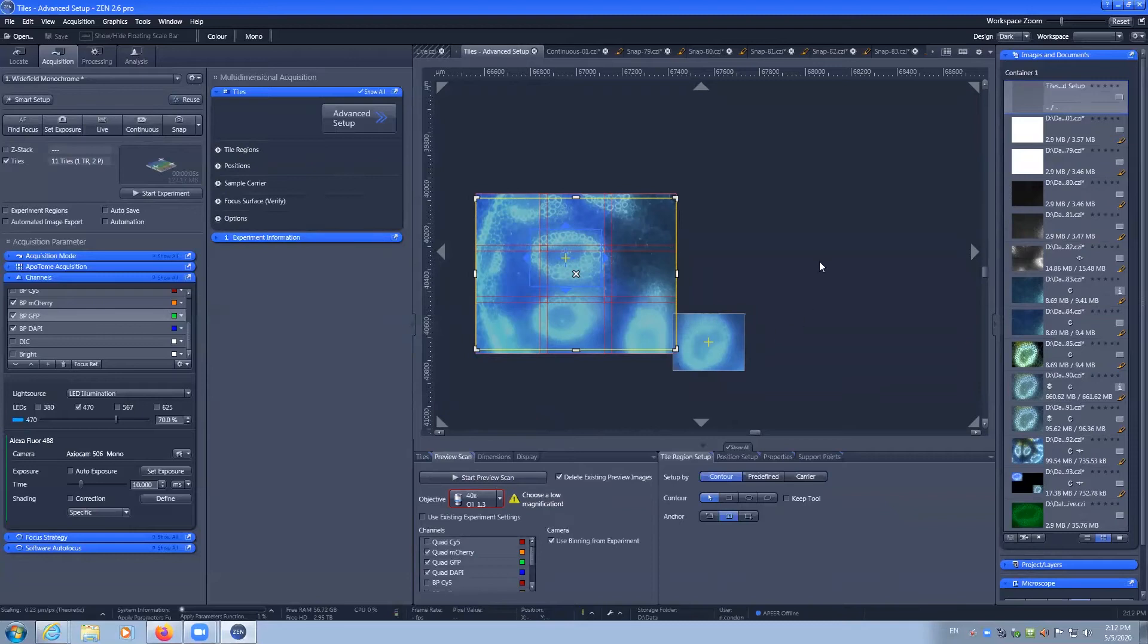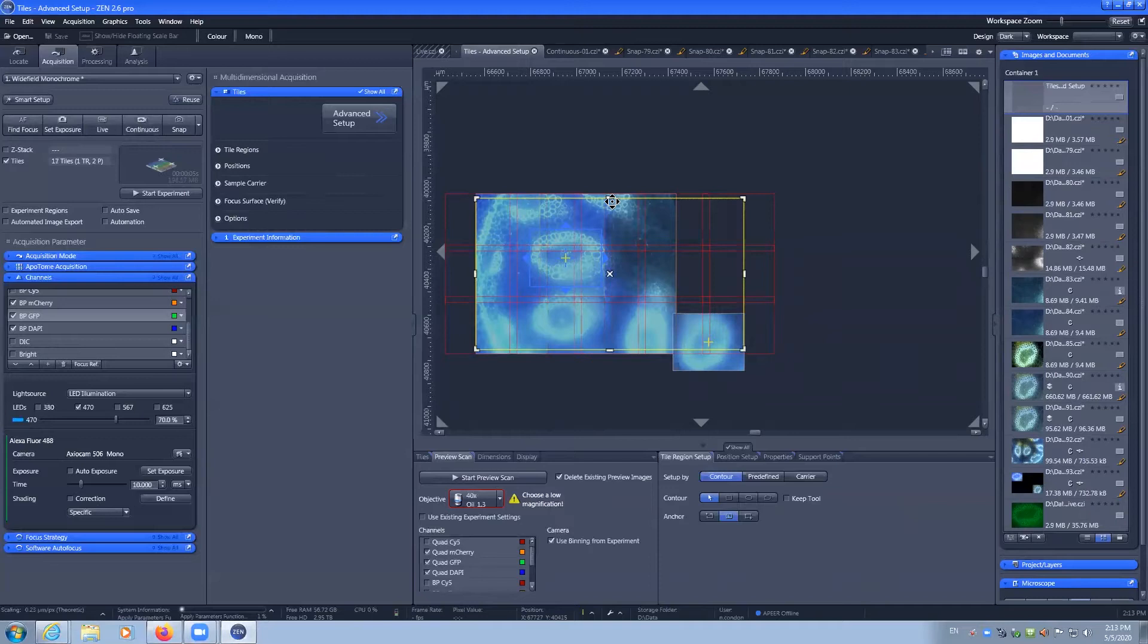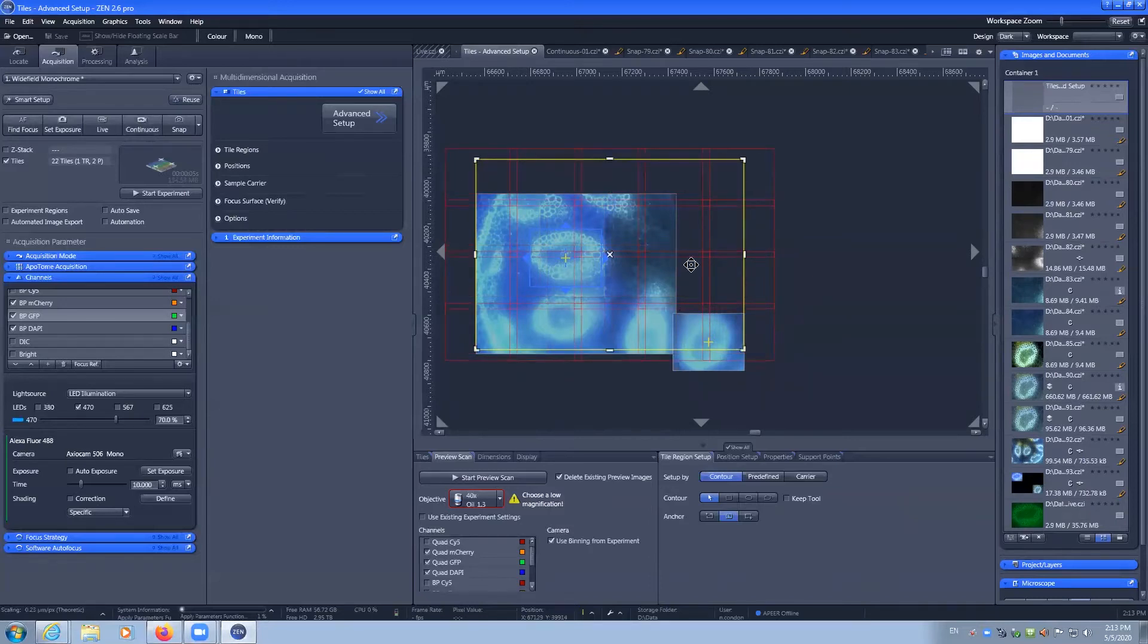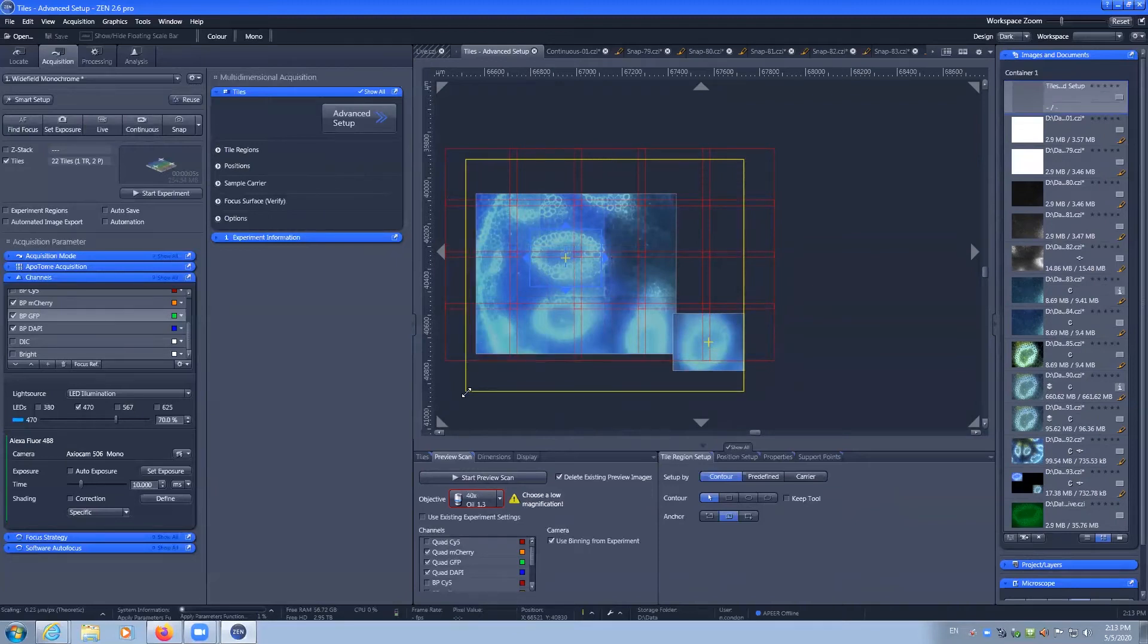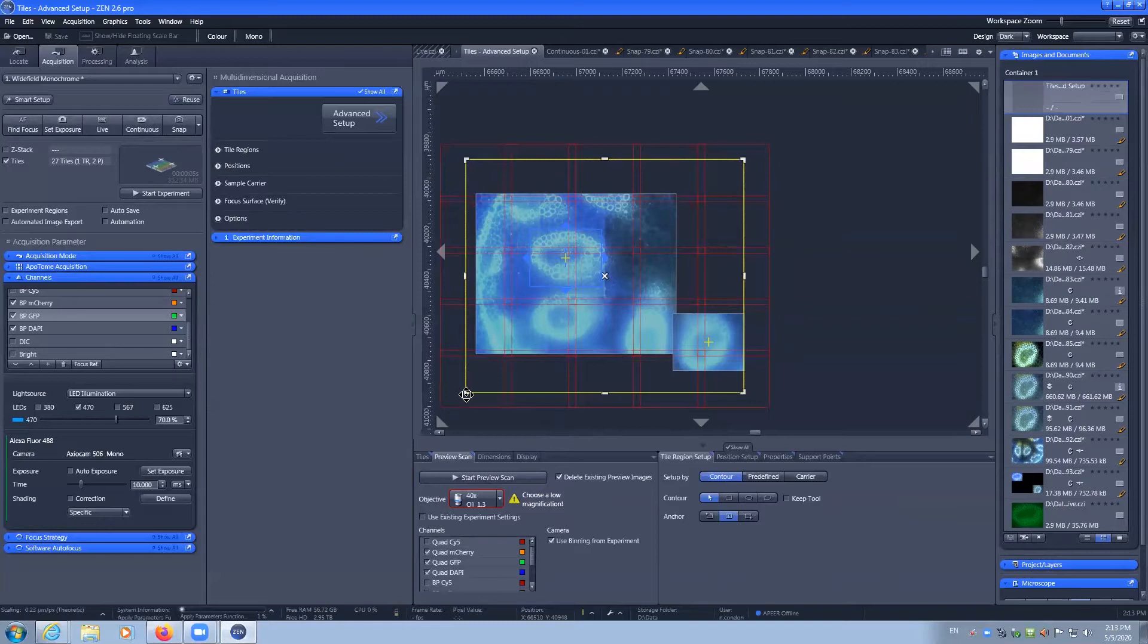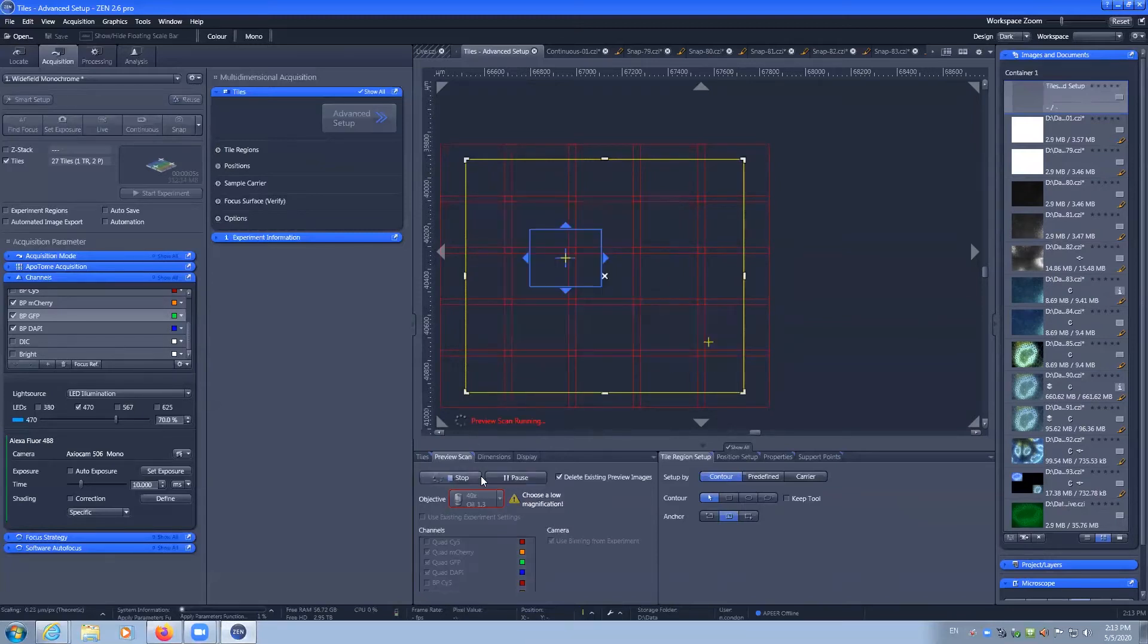We can see that if I want to make this tile a little bit bigger, now I can dynamically adjust which XY stage positions I want to include in my tile scan. I can then perform another quick scan to check that.